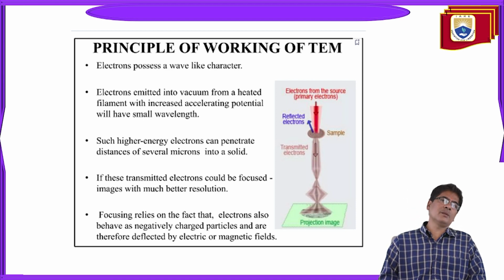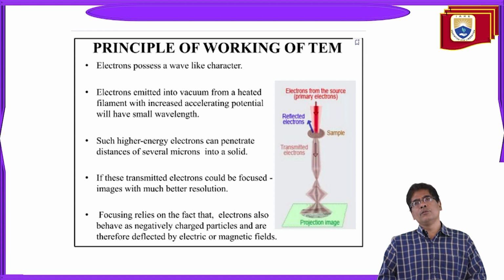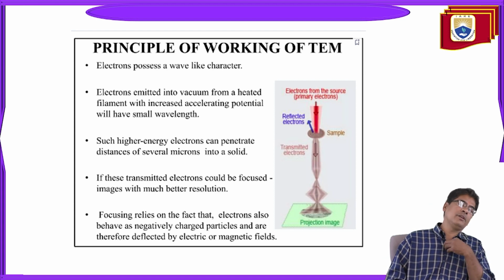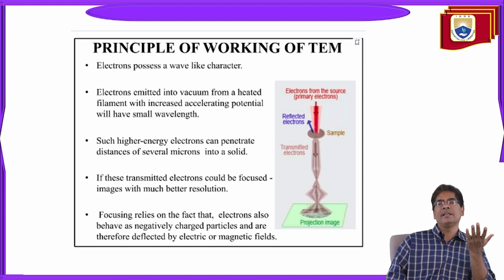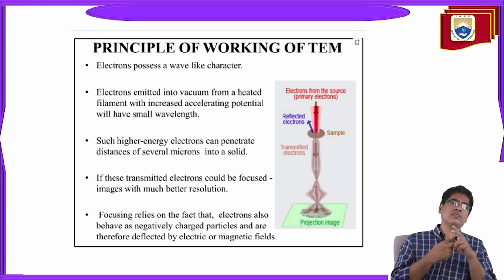In the Davisson-Germer experiment, we use a low tension battery and a high tension battery. The low tension batteries are used to heat the filament to dull red, and the high tension batteries are used to accelerate the electron beam. Similarly, here the electron accelerates.